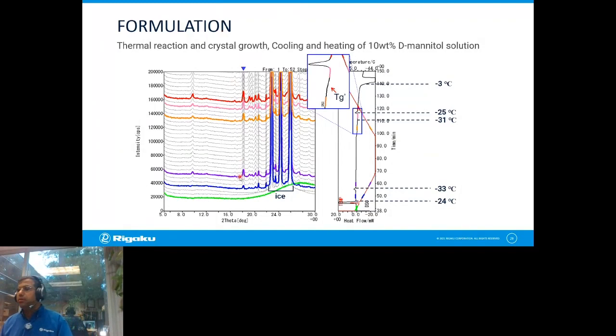So again, very quickly, this is an XRD-DSC combination using Rigaku's SmartLab equipment, where you can see the amorphous form from very ice cold temperatures and phase transformation into the desired forms and other forms. The DSC graph is shown on the right side, and the XRD evolution of the pattern, going through the glass transition temperature and from amorphous to crystalline, is shown here.